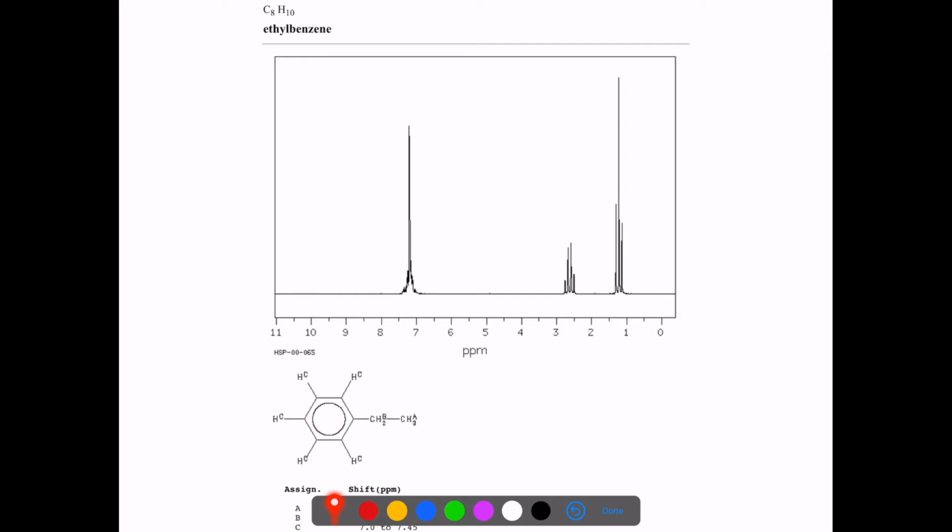And benzene, anytime there's a benzene ring with at least, it has 6 hydrogens, or even just a couple, benzene is characteristic that it always absorbs between about 6.5 and 9, and it's always a fairly ugly peak because these are all splitting one another and they show up. And so notice this is just one big smear as opposed to individual peaks that show up here. Alright, so this is one.